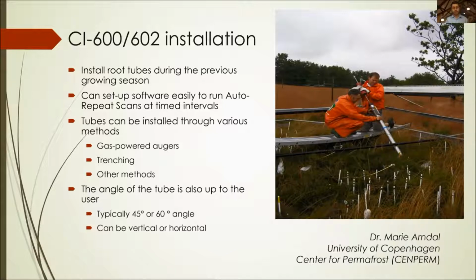There are many methods of installation I also want to mention. We typically suggest using a 45 or 60 degree angle. This is a little bit for historical reasons, and it also helps keep out things like rain and other environmental factors. But this instrument actually works either vertically or horizontally as well. I'll show you a little later in the presentation that you can install it in a lot of very ingenious different ways.